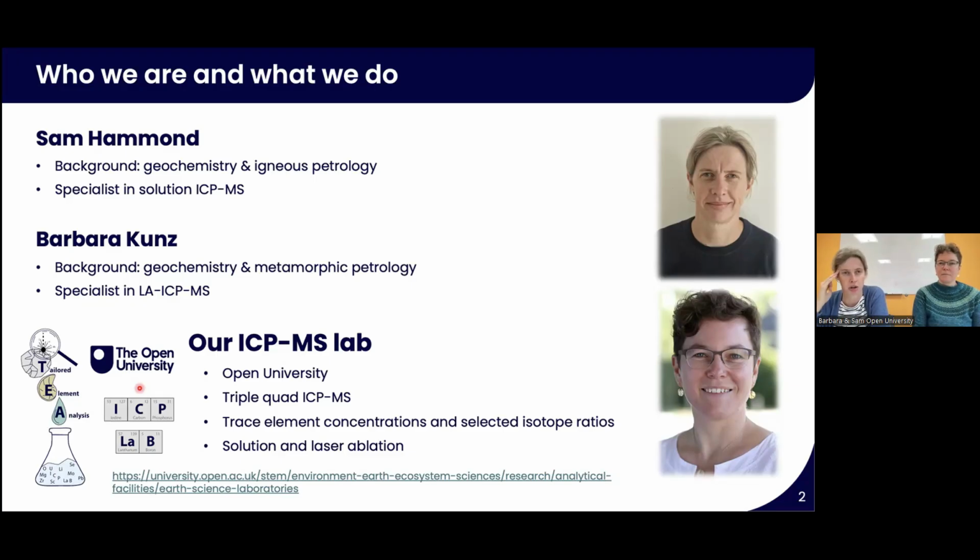So I started using a single quad instrument about 17 years ago when my tech career began. And for the last 10 years, we've been using a triple quadrupole ICP-MS here at the Open University.